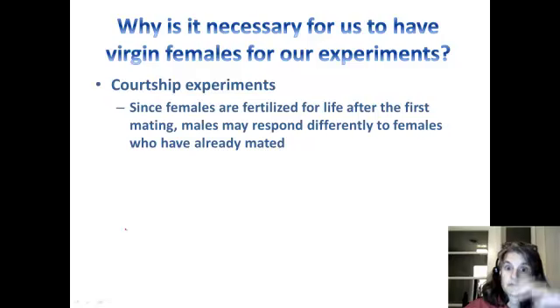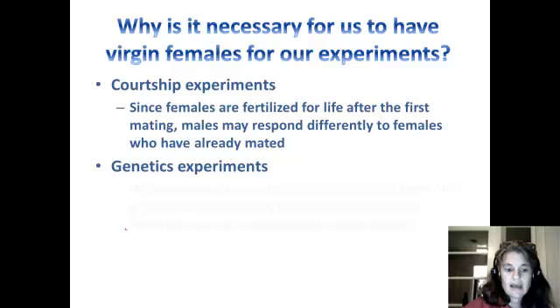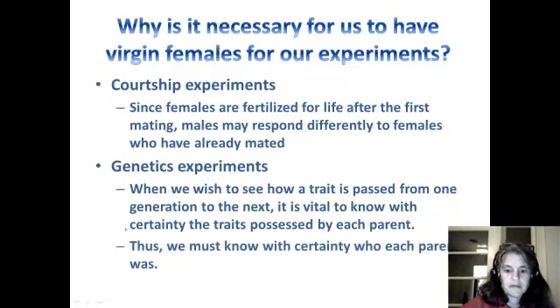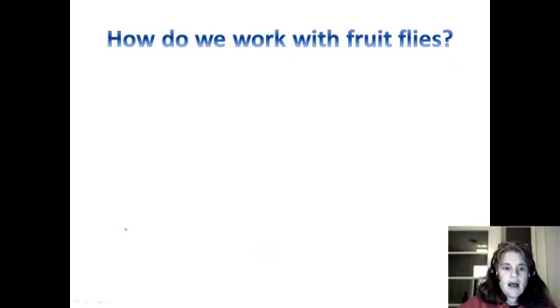So we want to do this with virgin females, so we'll see the best courtship displays possible. And of course, for genetics experiments, if your parentage is not correct, or if there's possibility of more than one parent, then your experimental results go out the window. Okay, so we've got to know with certainty who our parents are.